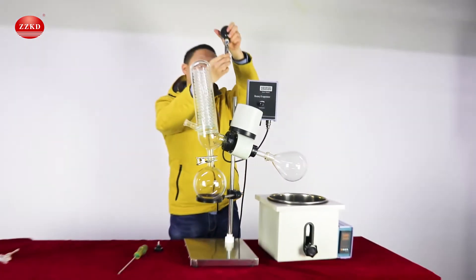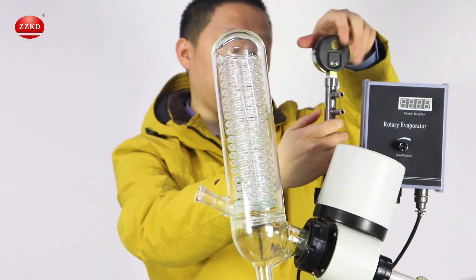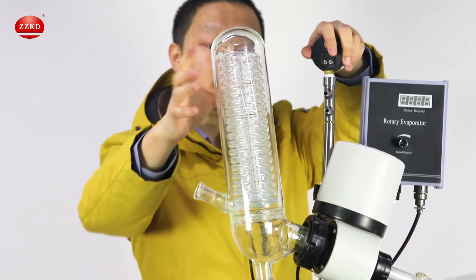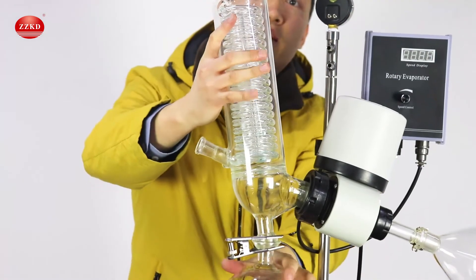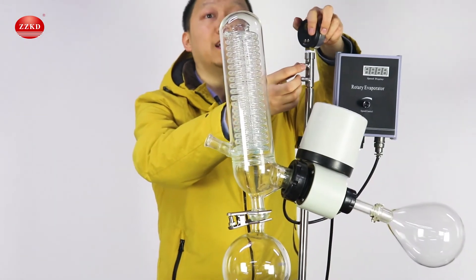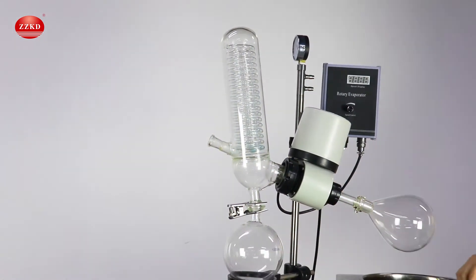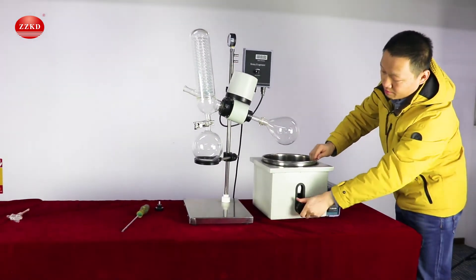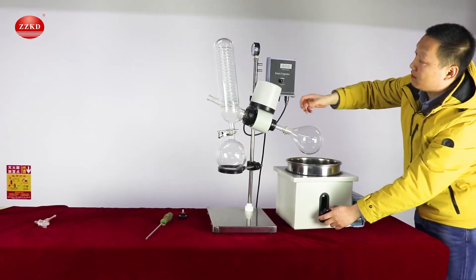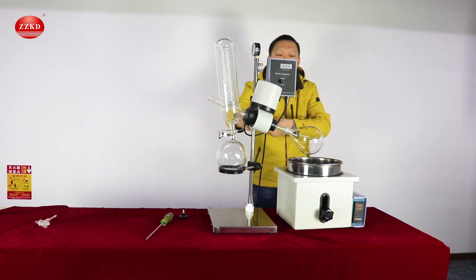Last one is the vacuum gauge. It's very easy — just put it here. These two holes: one is connected with this condenser to pump and create negative pressure inside the whole system, and the other one is connected with the vacuum pump. If you would like to change the height, you can manually operate here. If you've assembled it too high, you can use this part to lower it down later — no problem.